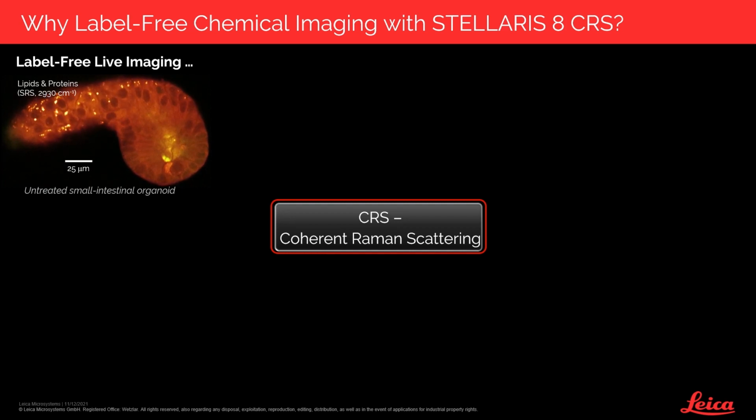We can immediately discern individual cells. We can see the cell nuclei as dark areas in this contrast. We can appreciate the overall organization of the organoid sample. And at the subcellular level, we can follow the dynamics of individual lipid droplets. This type of imaging can be done fast, at acquisition speeds up to video rate.